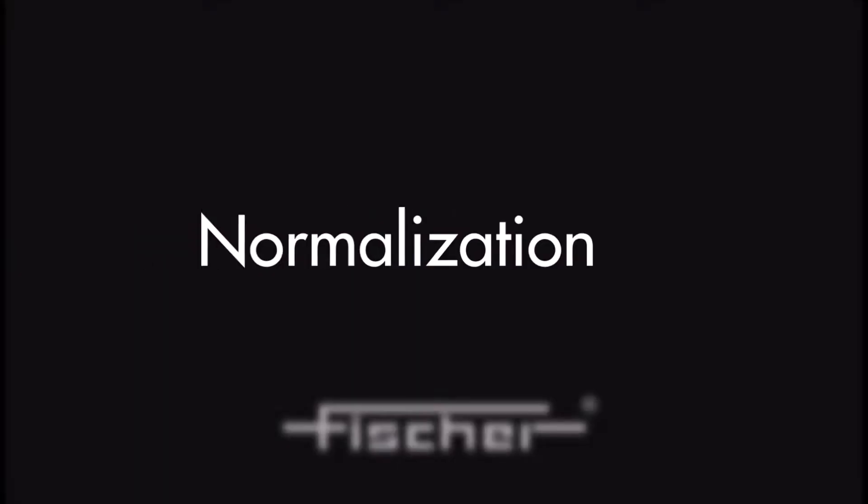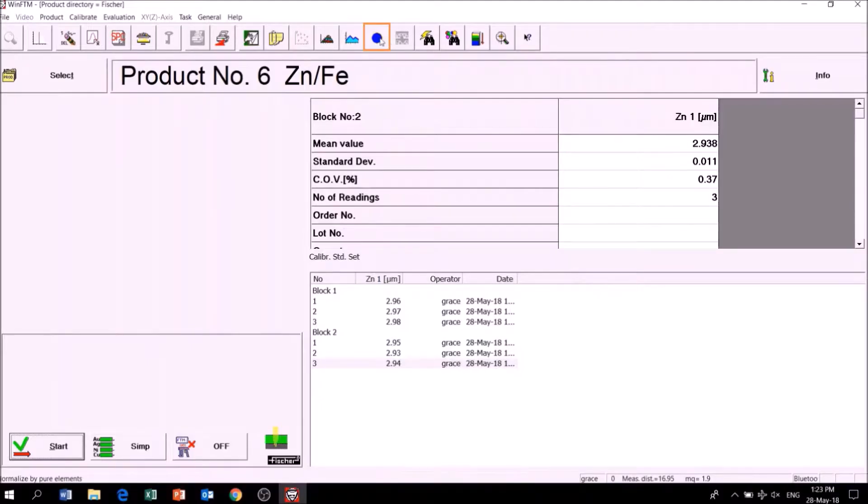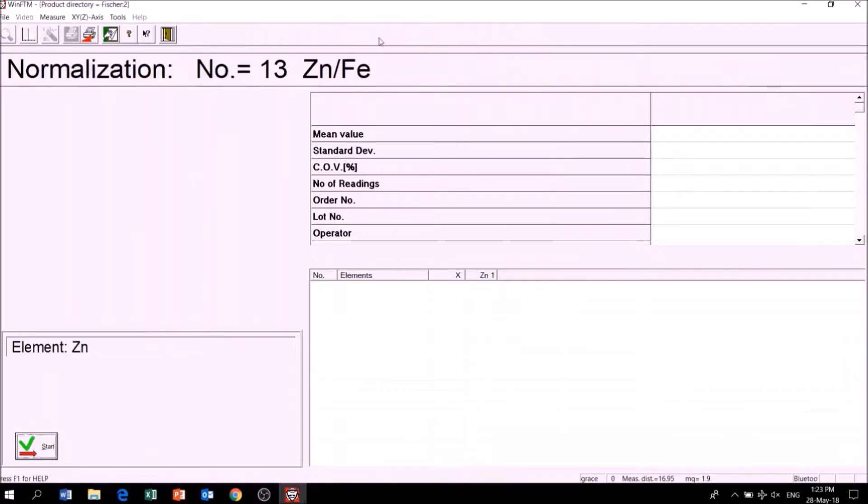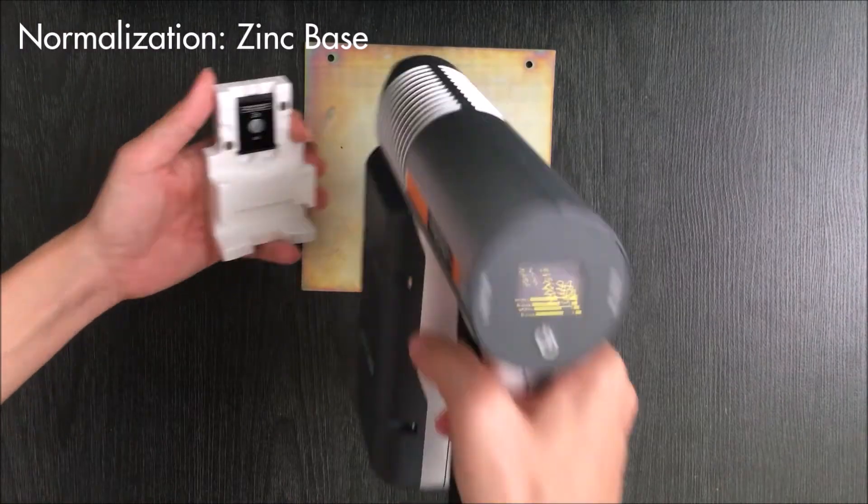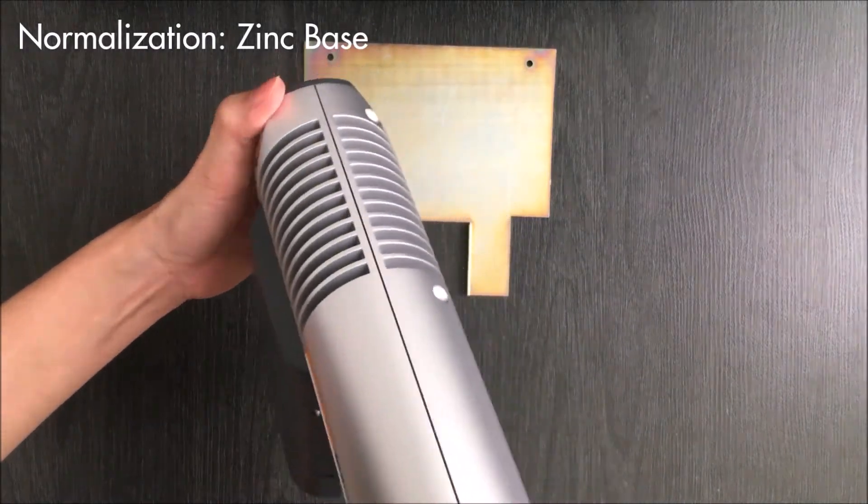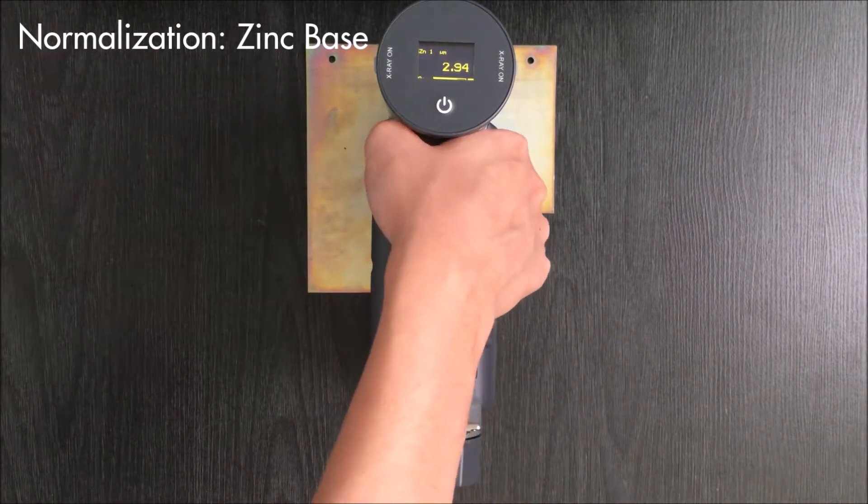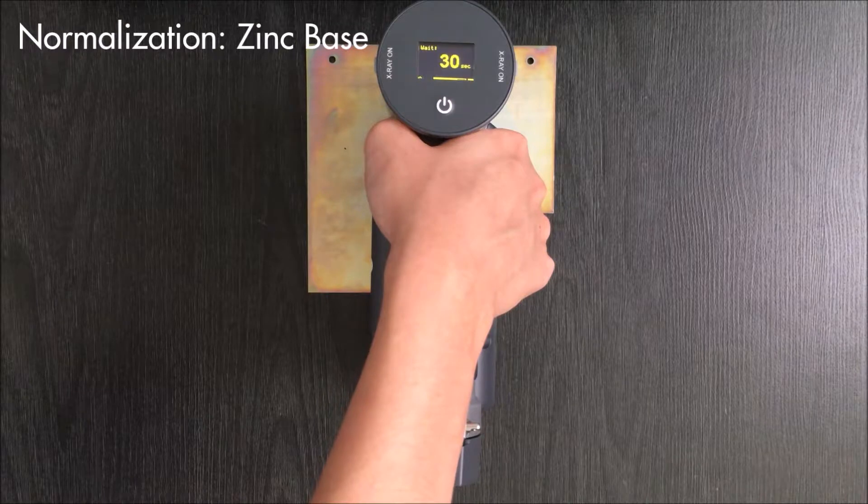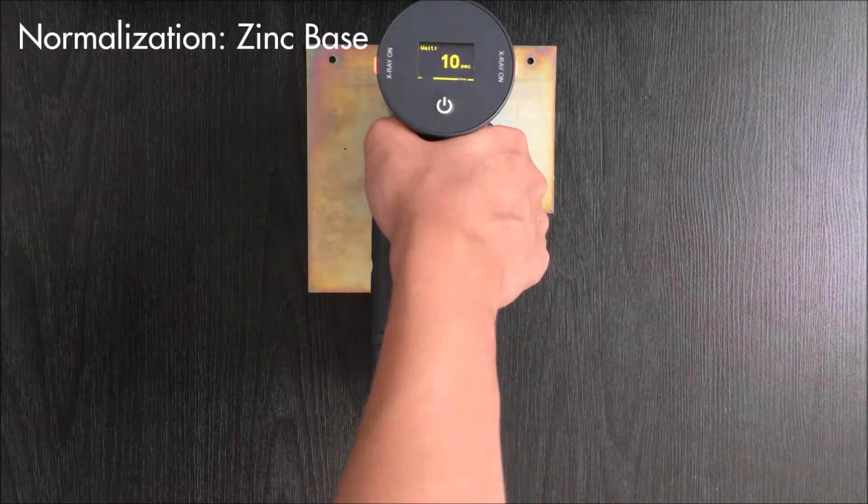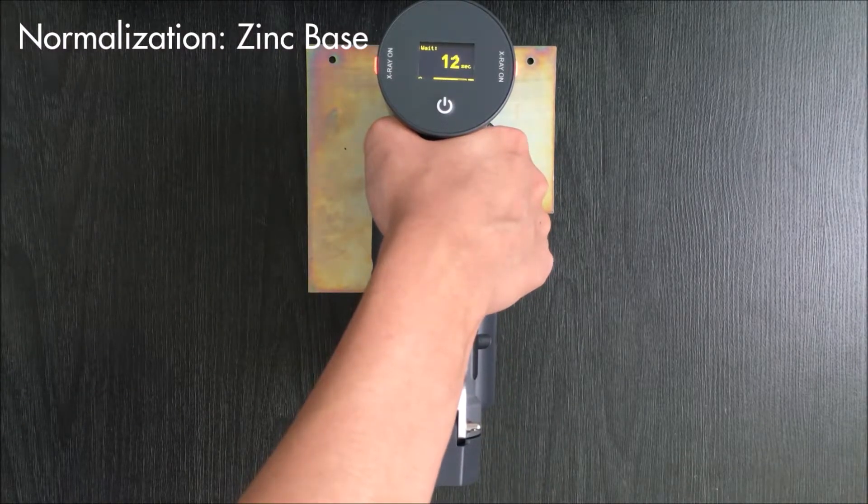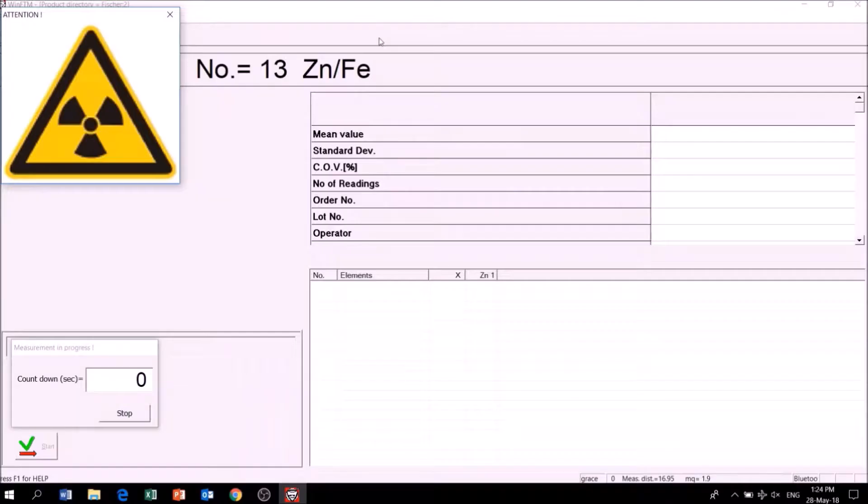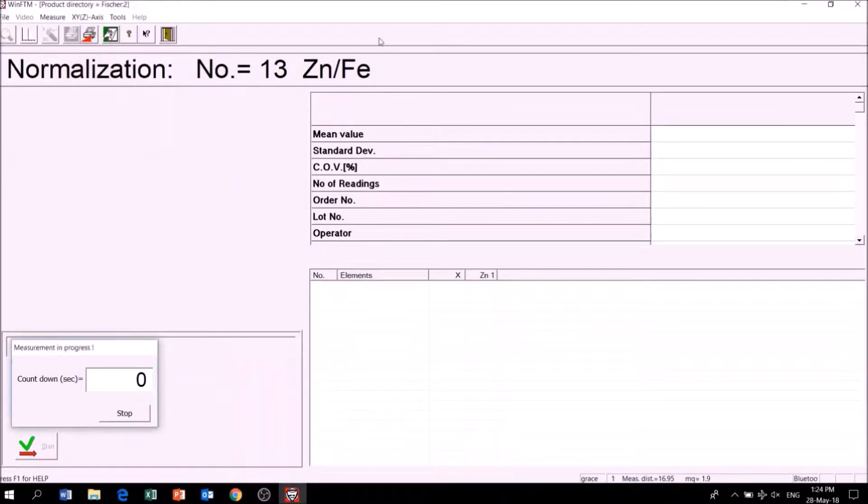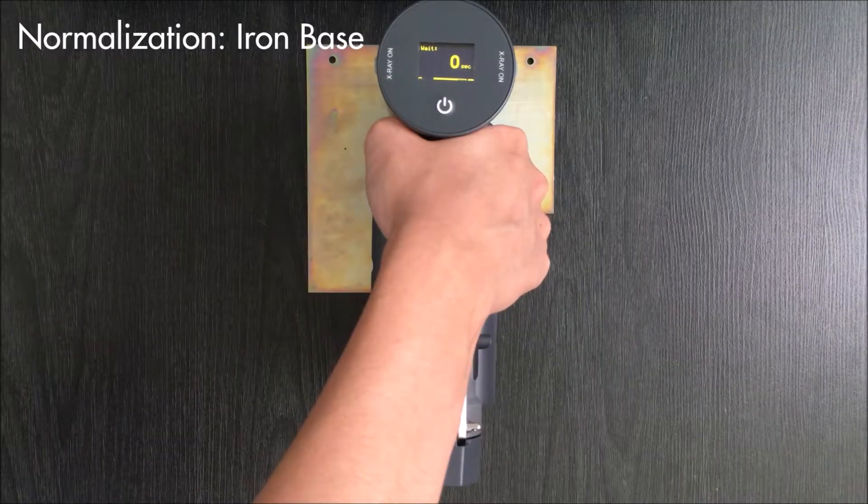Normalization is used to refresh the program after adjusting settings. In this case, I will normalize the instrument with a zinc base. Next, I will normalize the instrument with an iron base.